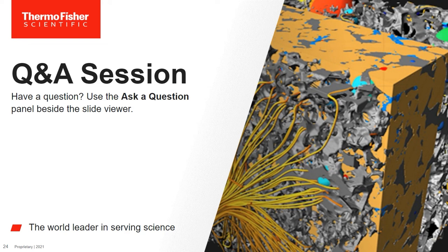The first question I have for both of you is, have you ever looked at pharma samples with API? I can say yes to that. I would assume by API you mean active pharmaceutical ingredient. We actually have used that in the correlative workflow. We use the CT to determine the size of the particle, and then we have used FIB-SEM and cryo-FIB-SEM and cryomicrotomy to actually section into the particles and produce higher resolution scans of the pill or particle that we're looking at.